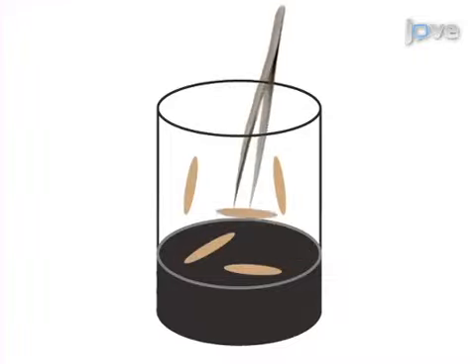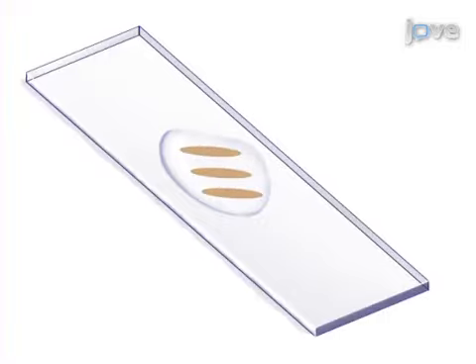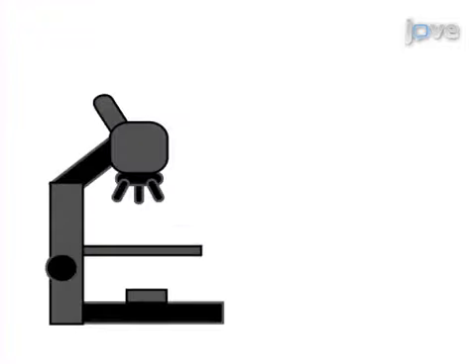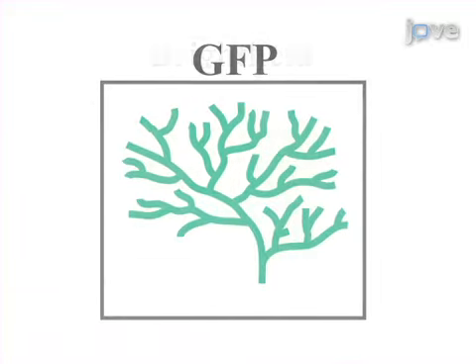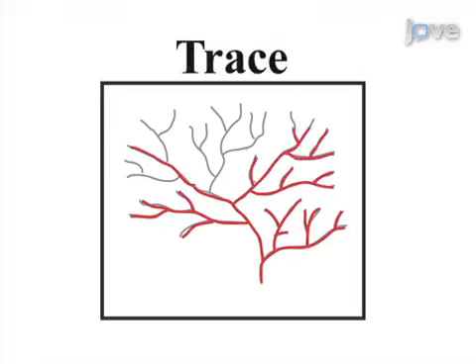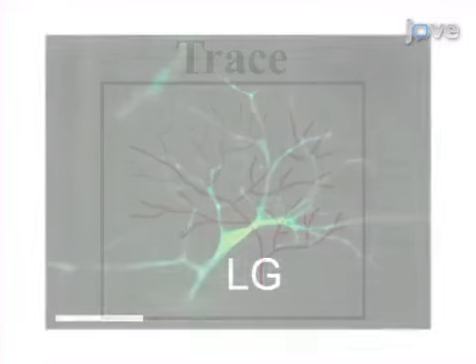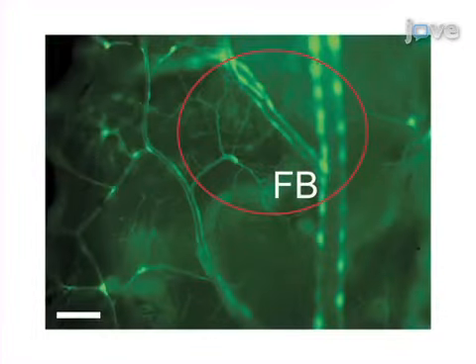The second step of the procedure is to collect mosaic larvae and fix them using heat. The third step is imaging labeled terminal cells in fixed animals using GFP expression to observe branches and bright field microscopy to observe tubes. The final step is quantifying the terminal cells' morphologies. Ultimately, results can be used to distinguish and categorize distinct cellular morphologies of wild-type and mutant terminal cells.